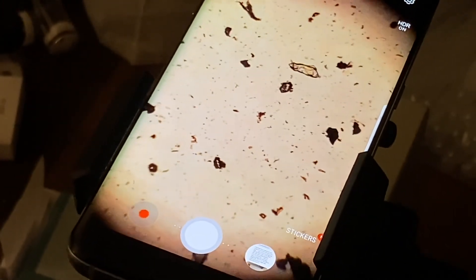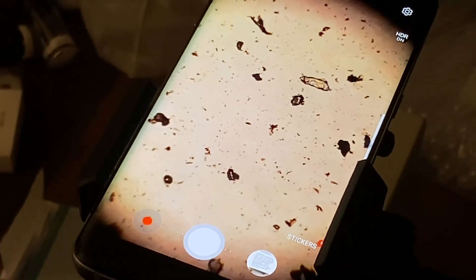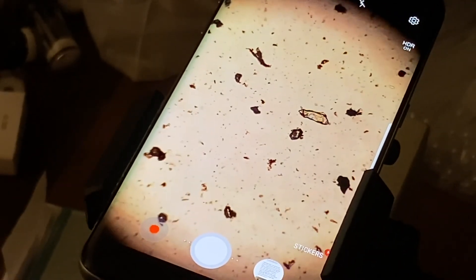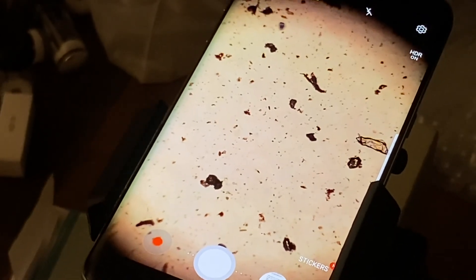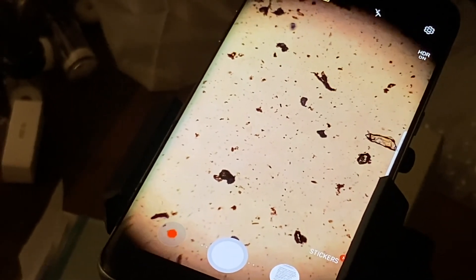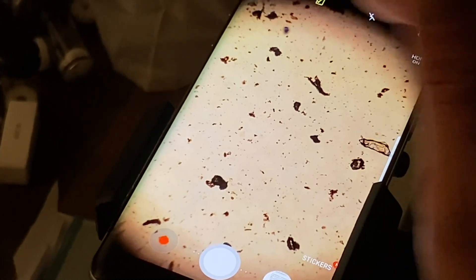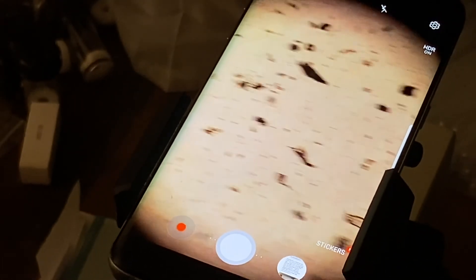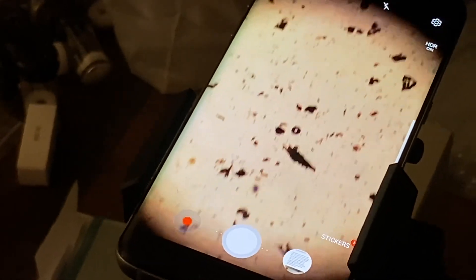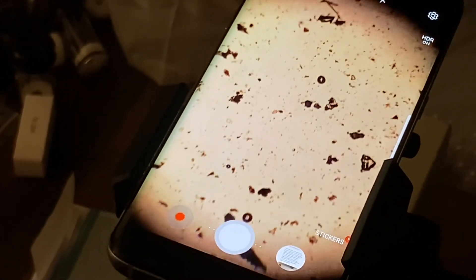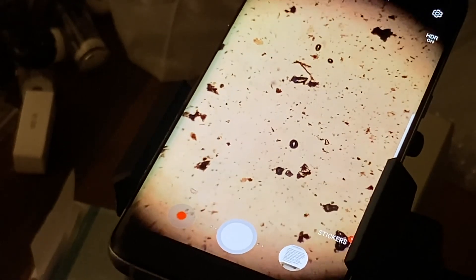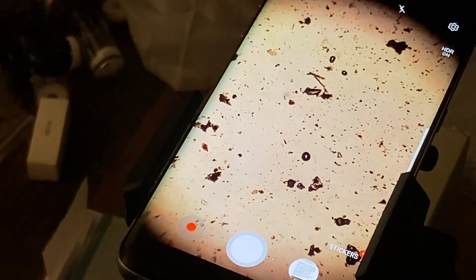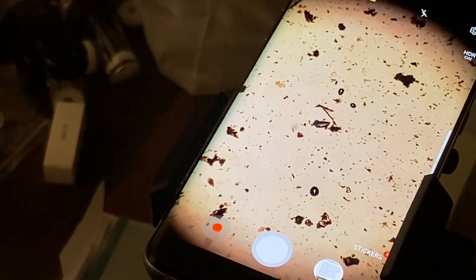Some of the other things we're looking for are good mineral content. Jagged, kind of glass-looking, sandy-looking structures are a lot of times minerals, and we want to find that in the soil. All these little black chunks are biochar. That's going to attract fungi over time. You can see actually here's some growing off — that's a new piece of fungi growing off the biochar right there. So it's already doing its job.